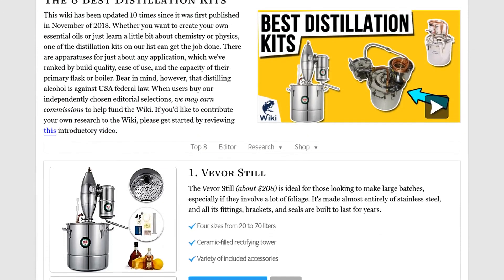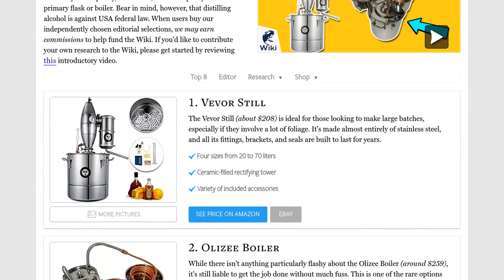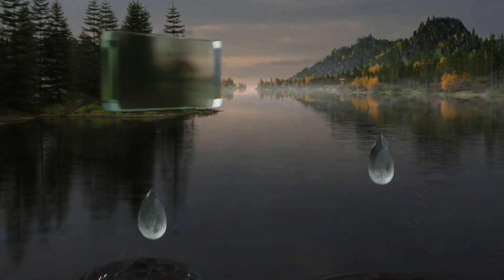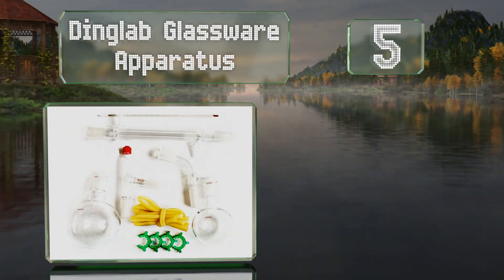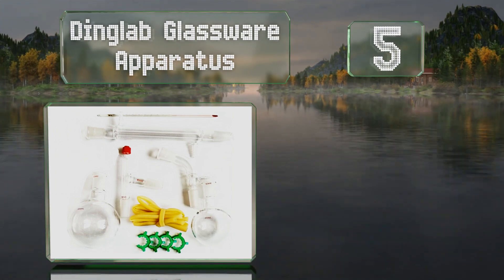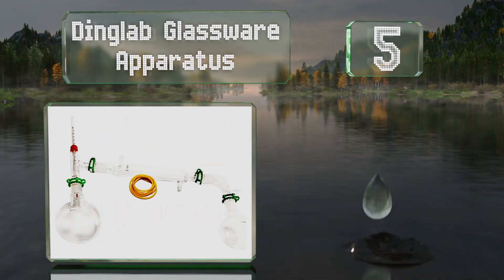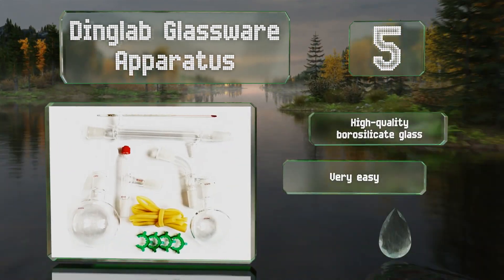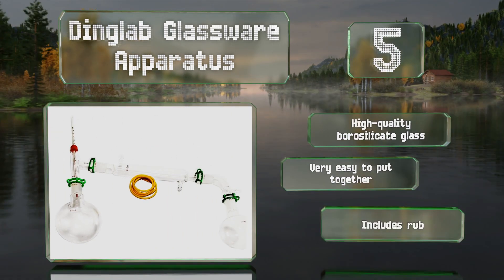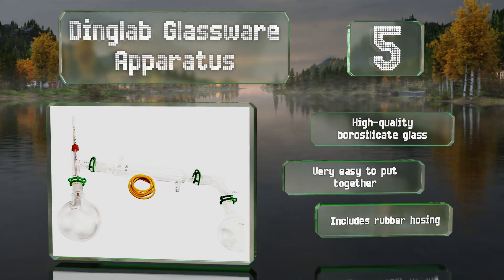At number five, anyone looking for something simple that can provide students of chemistry or physics with a few useful and educational experiments might appreciate the design and low price of the Dinglab Glassware Apparatus. It's equipped with high quality borosilicate glass and rubber hosing, and it's very easy to put together.